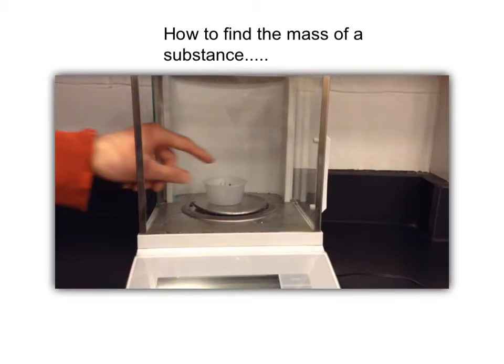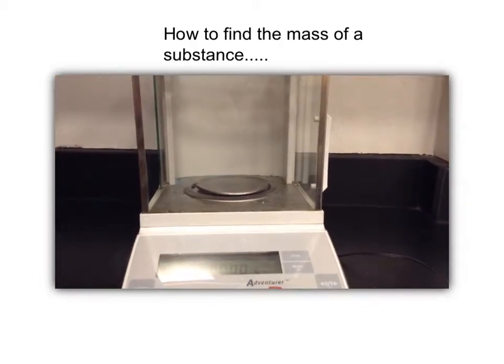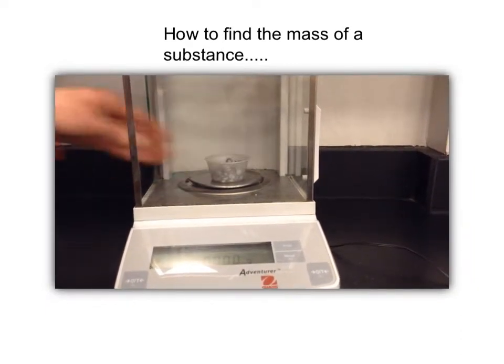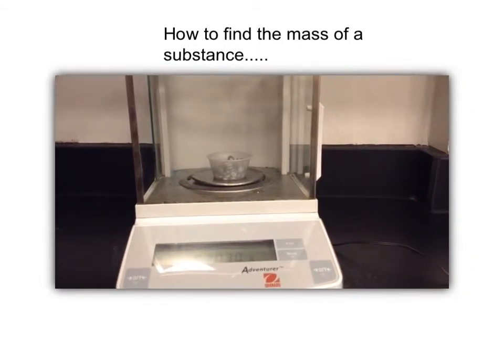Here's how we find the mass of our substance. We pre-weigh the weigh boat. We add the sample to it. We determine the mass of the sample plus the weigh boat. And then we subtract the weigh boat from it, giving us just the mass of the sample.